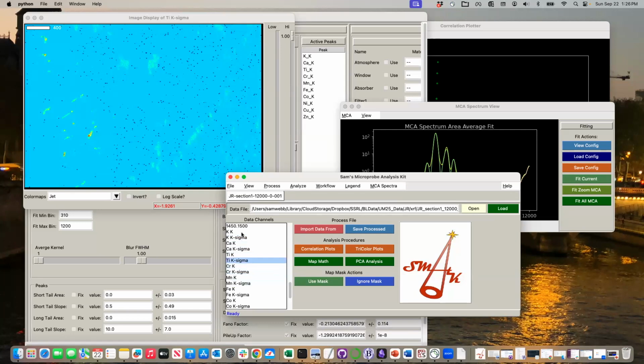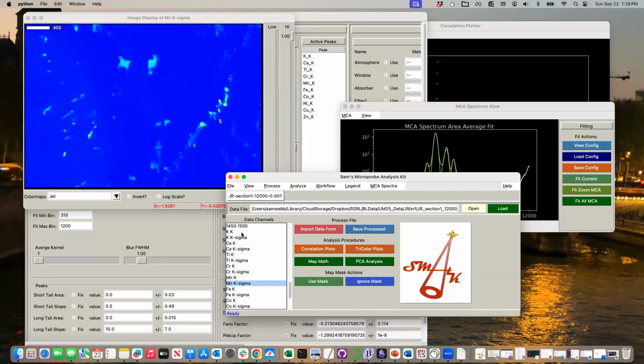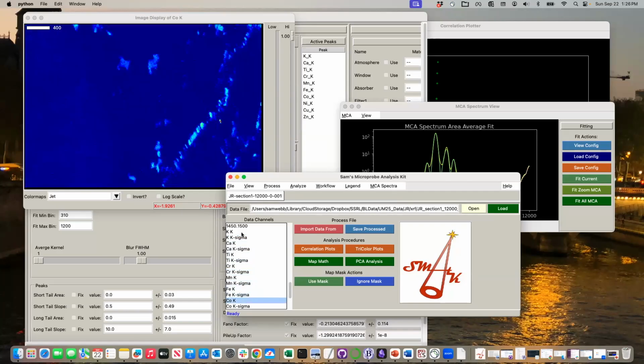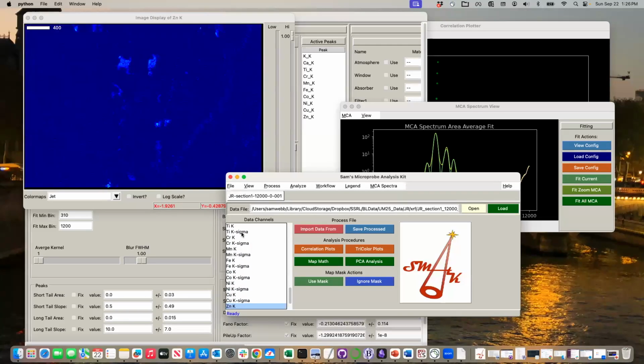So we're going to notice here that we have a high error bar on titanium. Right? You're going to be like, huh, I wonder what that is. We'll talk about that in a minute. We'll come down here and you say, okay, chrome, okay. Sometimes it's just high because you have a lot of concentration on it. You can kind of see some of those areas. But it looks pretty nice overall. We're going to take a look at this real quick, though.